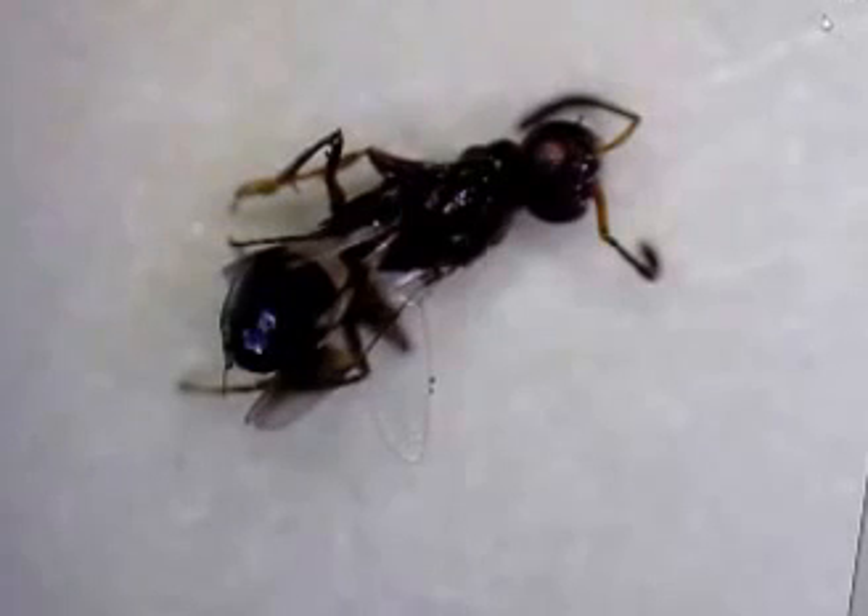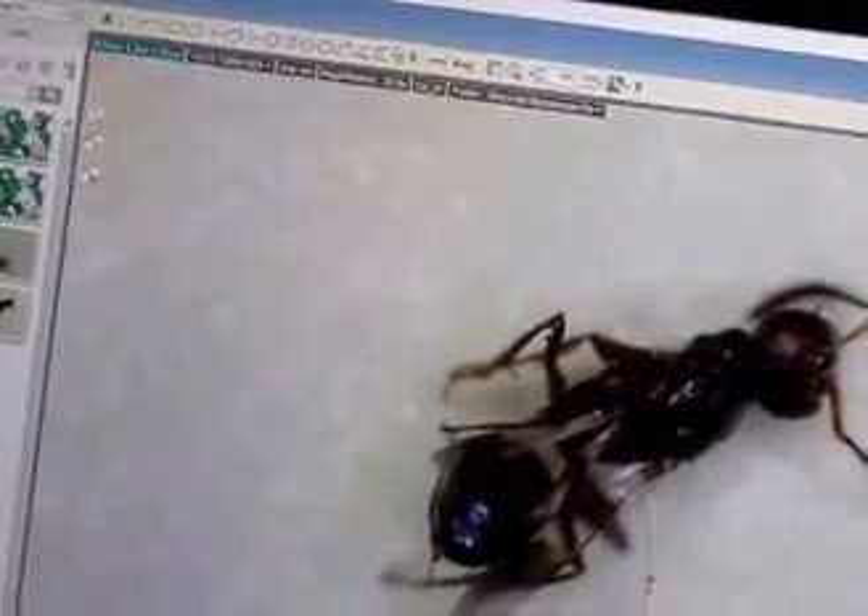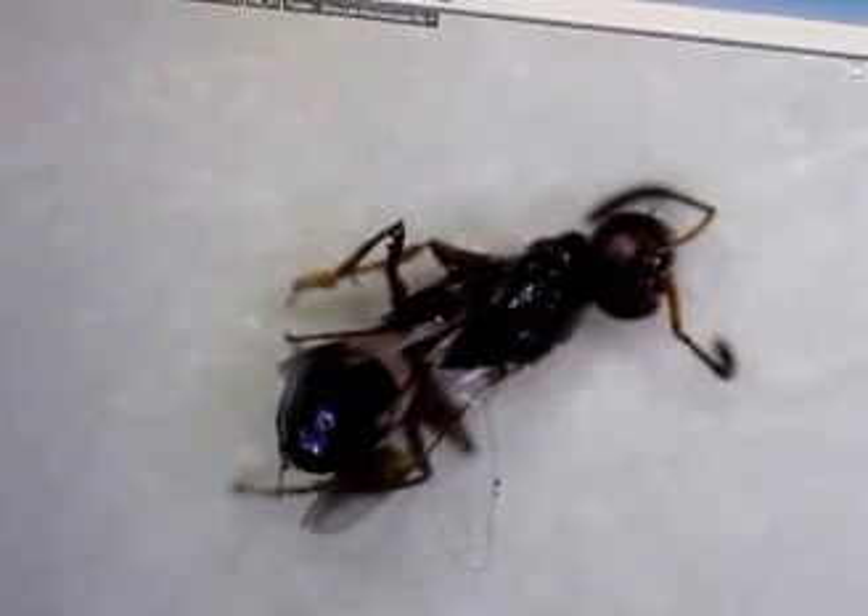I think we're going to call it quits here, but just wanted to give you an idea what you can do with the hardware and software. It's really fun and educational — I imagine especially for kids. I had a nice microscope when I was about nine years old and couldn't dream of doing things like this: seeing it blown up on screen and taking pictures. You can use the included software to do drawing and measuring, or take images into Photoshop or other software to make a slideshow or a report for school.